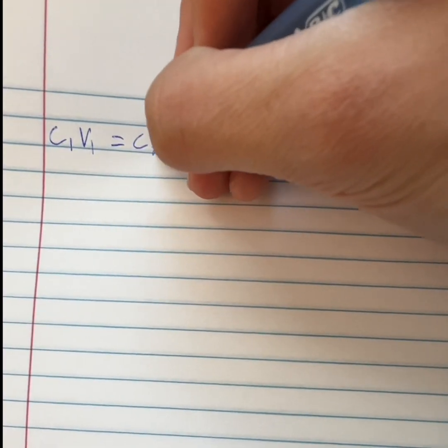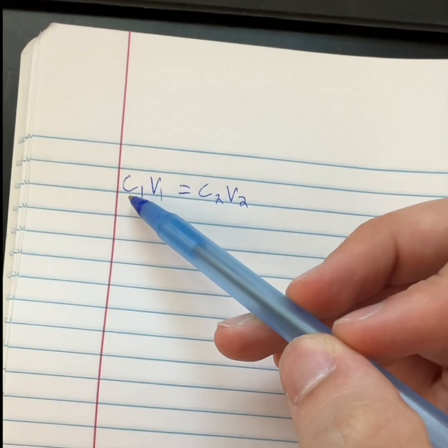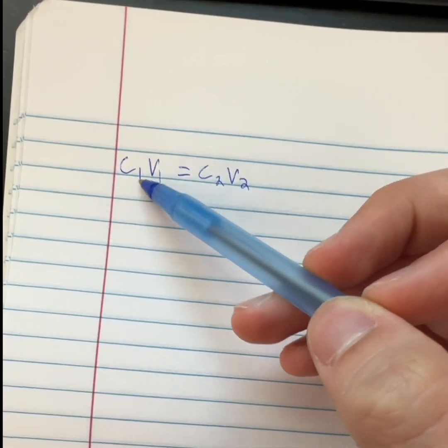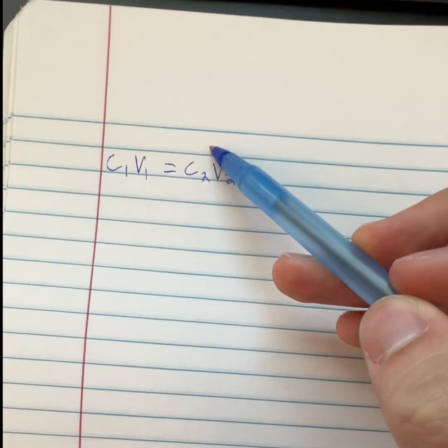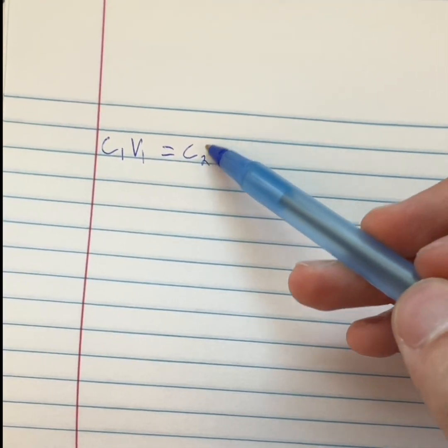And so we're going to use an equation that is C1V1 equals C2V2. C1 and V1, this is your initial concentration and the initial volume that you're working with. And then C2 and V2 are the diluted concentration and the diluted volume that you're working with.